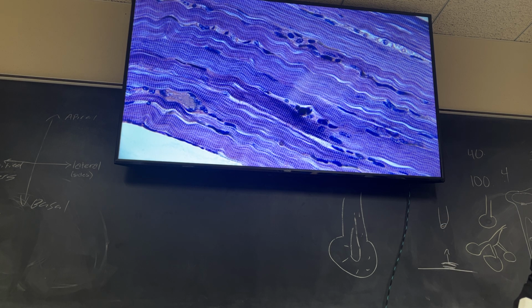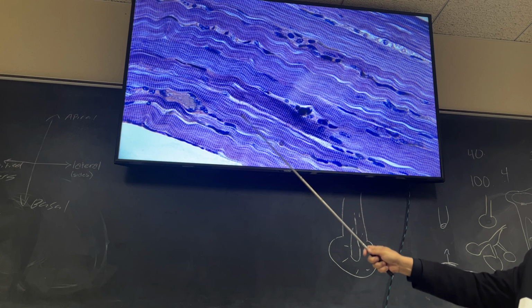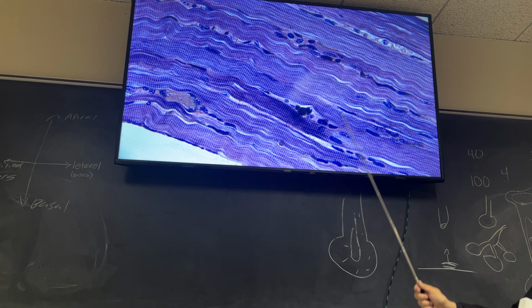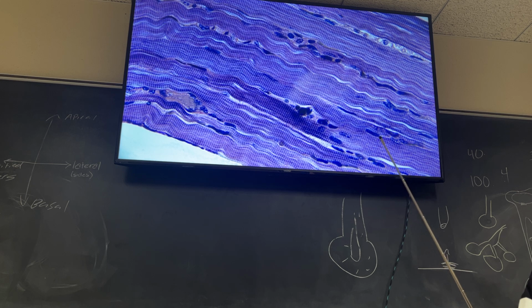Where's the mitochondria? All right, so nuclei are big, right? So nuclei are these big things. Mitochondria are going to be small, like so, and little tiny things, not very big. They're not very big like this one and that one. They're little and small, but they're pushed off to the side as well.